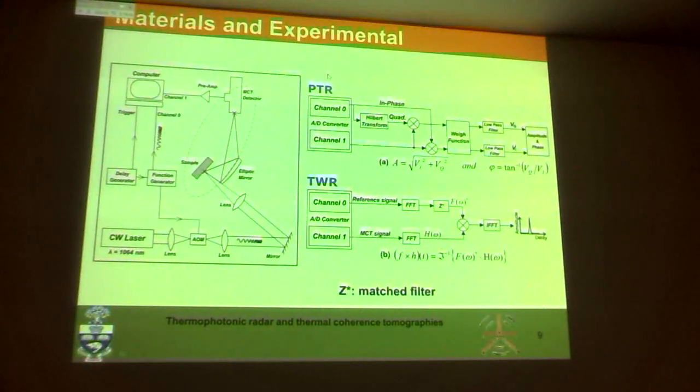That is your thermal wave field. Here's a signal generation drawing. I have a CW laser. I modulate that with a chirp. Then I take the light and focus it on the sample, and the temperature rises. It could be focused, it could be defocused, you could have 1D, 2D, 3D, you name it. All of these things depend on the size of the beam versus the size of the diffusion length. If the beam is large compared to the thermal diffusion length, then you're going to be 1D.